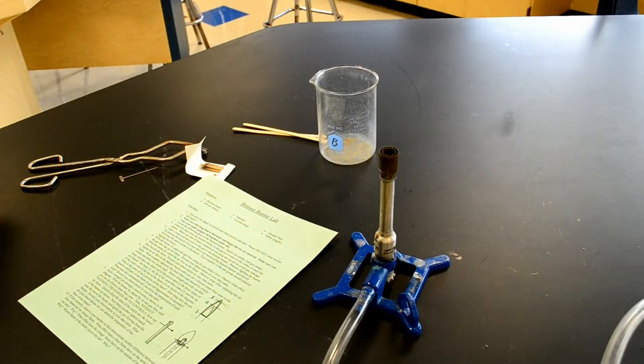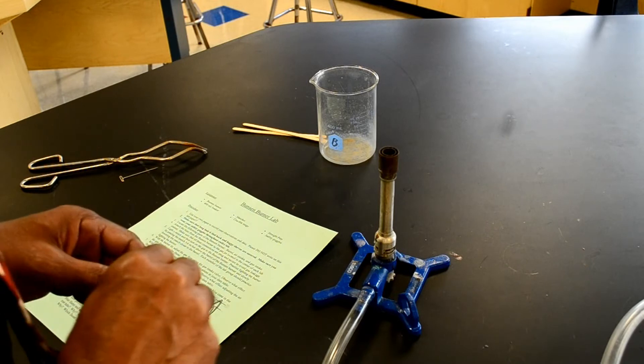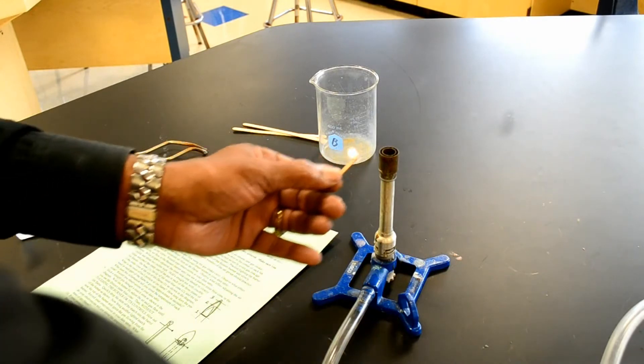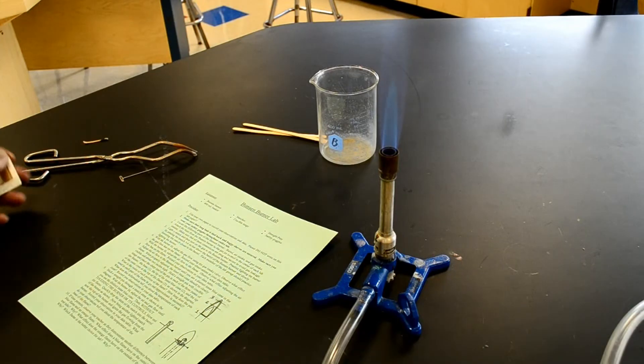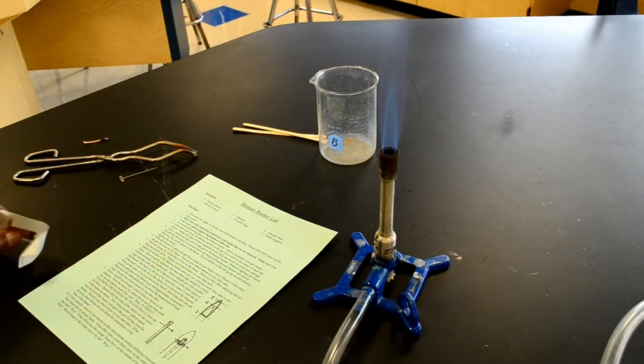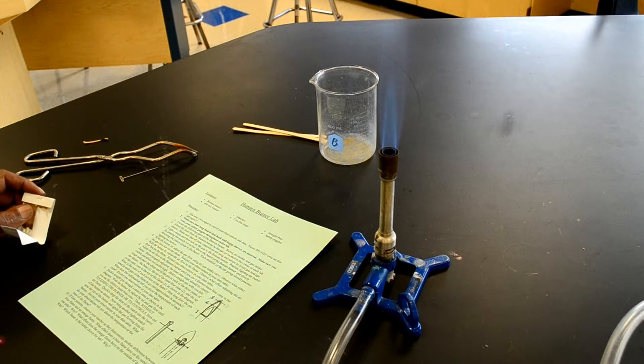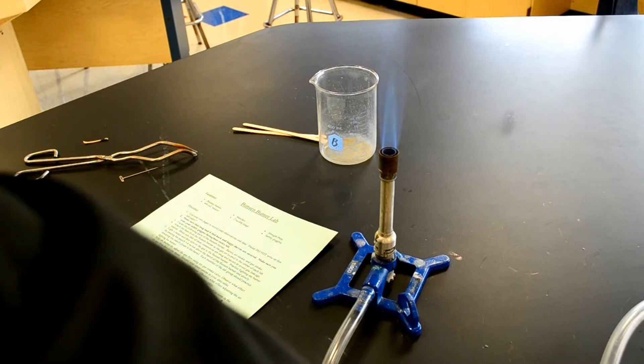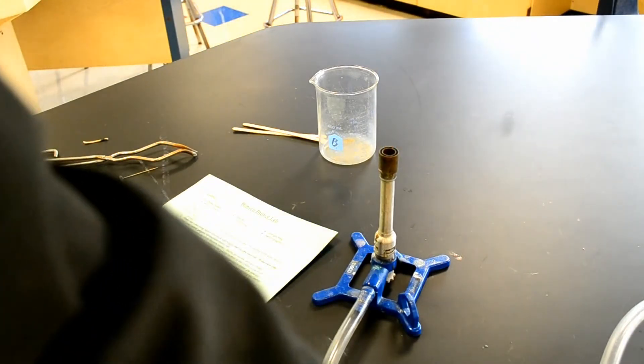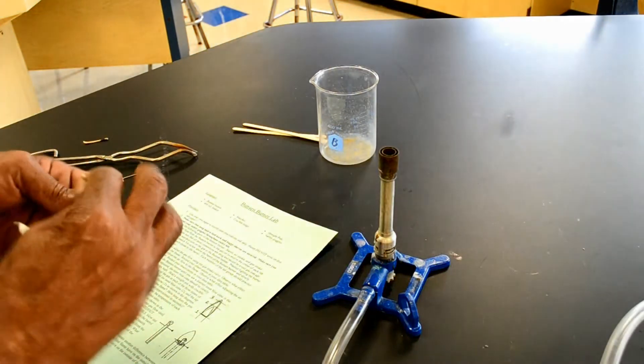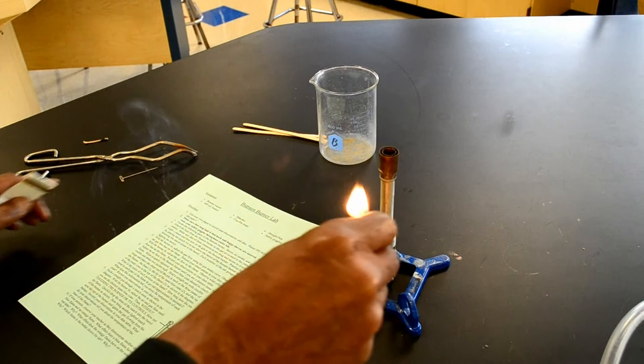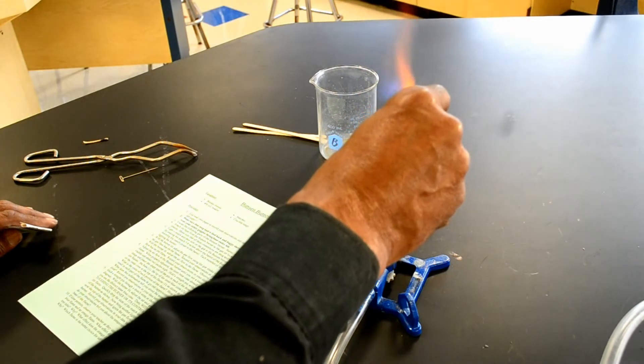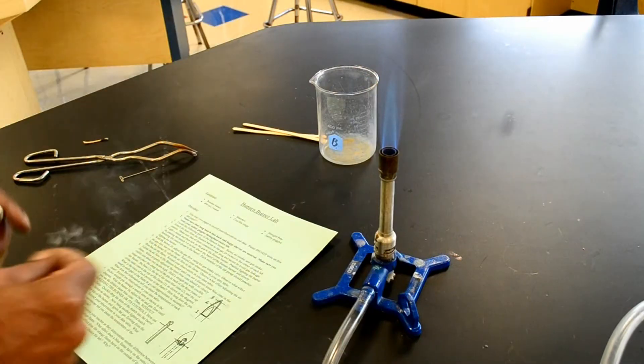Now it says light a match. Turn on the gas to the burner. Then it says practice lighting the burner by placing the match five to six inches above the burner, the barrel of the Bunsen burner, and slowly lowering the match to the barrel. Let's try that. I'm going to turn on the gas, I'm going to light another match, and I'm going to hold it five to six inches above the barrel, lower it to the flame, and you can see that it works.